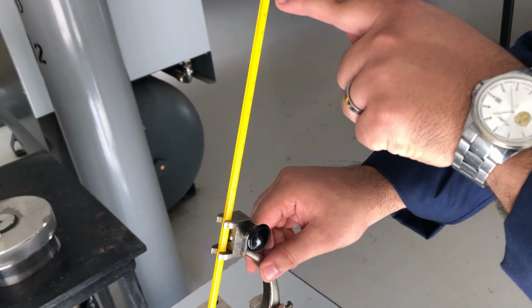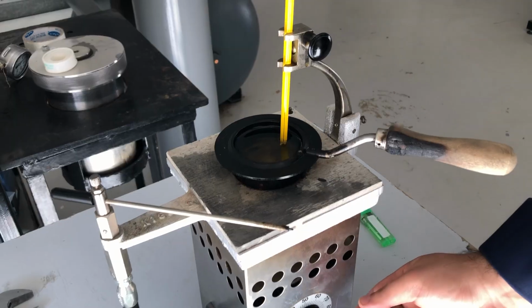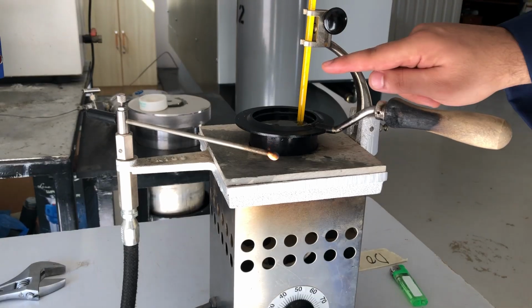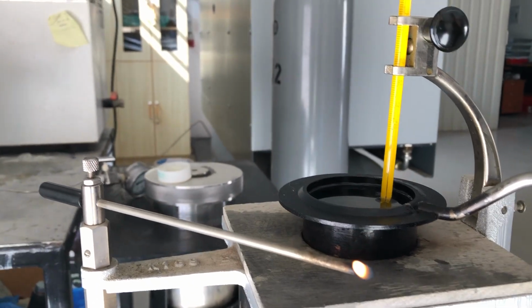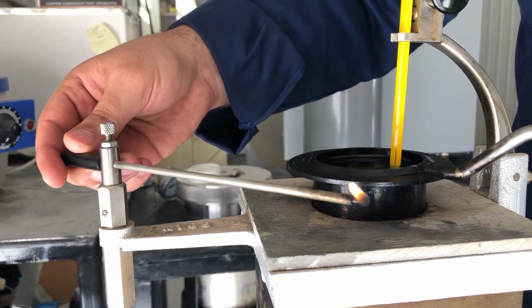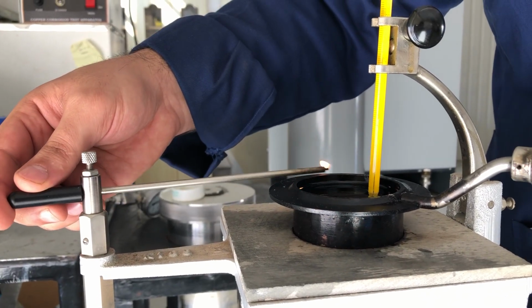to 400 degrees Celsius. What we have to do is start the heater, and the temperature of the sample will increase. We have to watch the temperature, and meanwhile we have the flame. The flame should pass through the surface of the oil. This is the cooking oil.